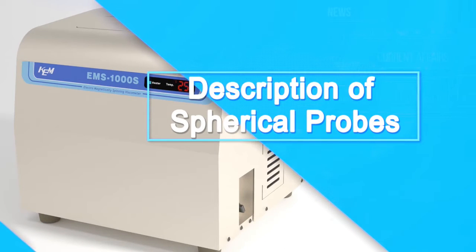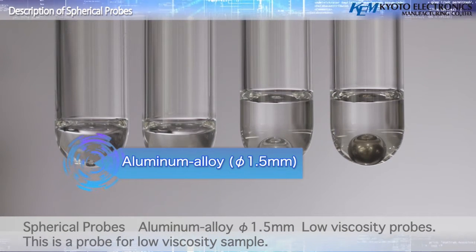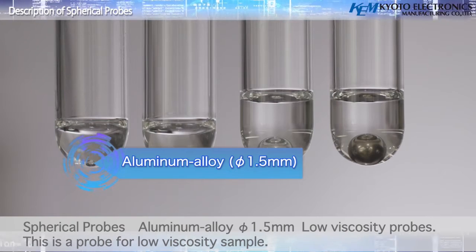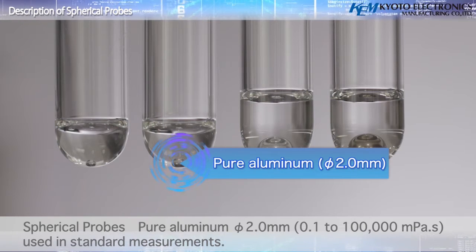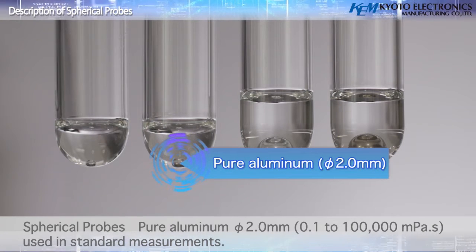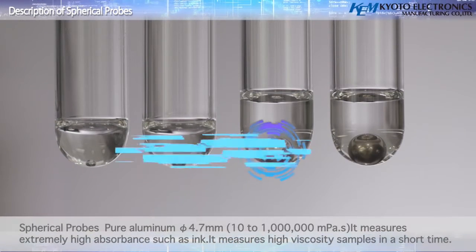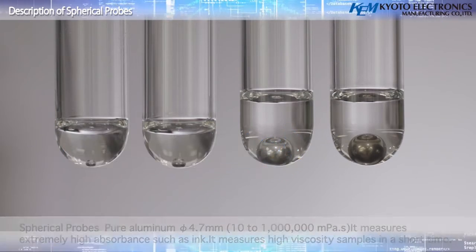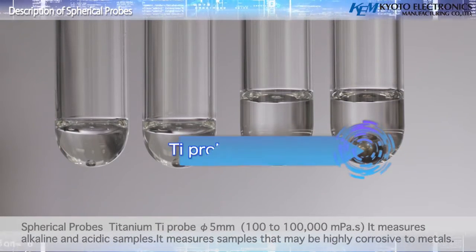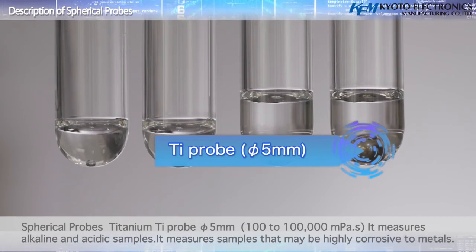Description of spherical probes: aluminum alloy 1.5 millimeters, a probe for low viscosity samples; pure aluminum 2.0 millimeters, used in the previous model EMS 1000 as well as in standard measurements; pure aluminum 4.7 millimeters, used in standard measurements and in the previous model EMS 1000; titanium probe 5 millimeters, a highly chemical-resistant probe that can be used in acidic or alkaline samples.